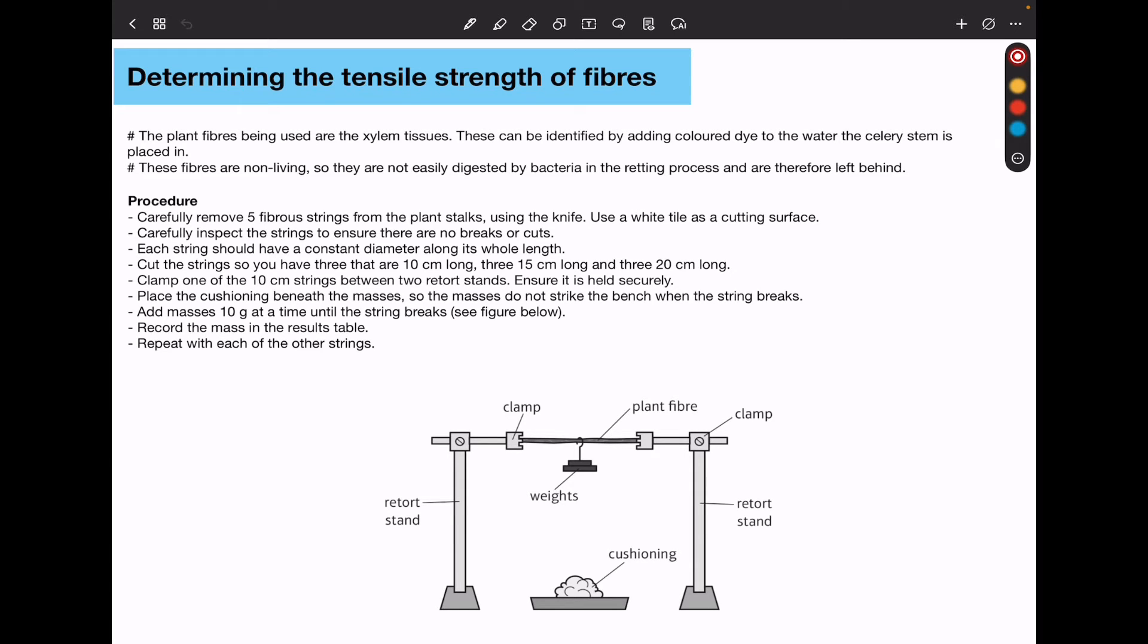Carefully remove five fiber strings from the plant stalks using a knife. Use a white tile as a cutting surface. Carefully inspect the strings to ensure there are no breaks or cuts. Each string is going to have a constant diameter along its length.